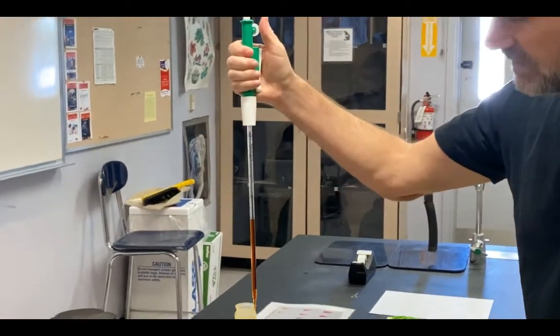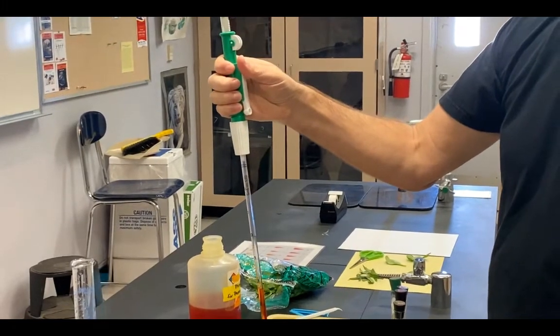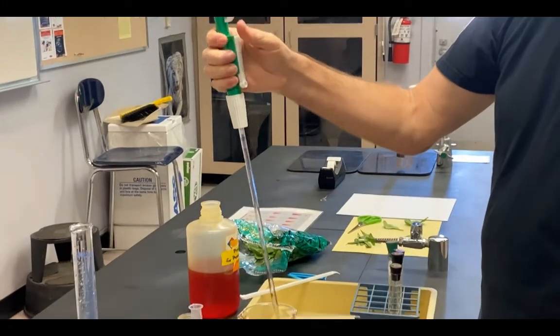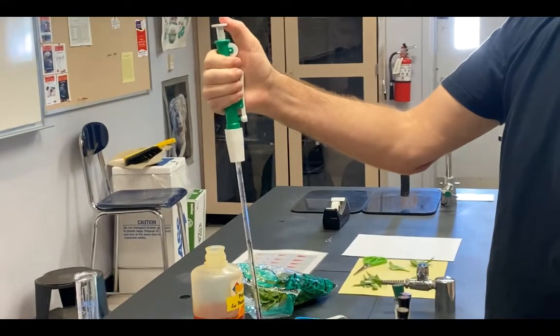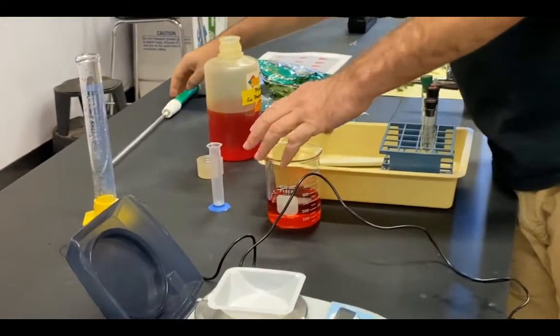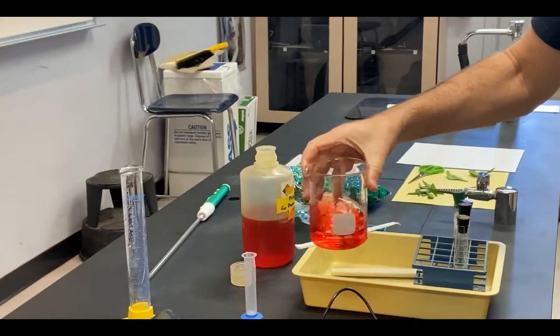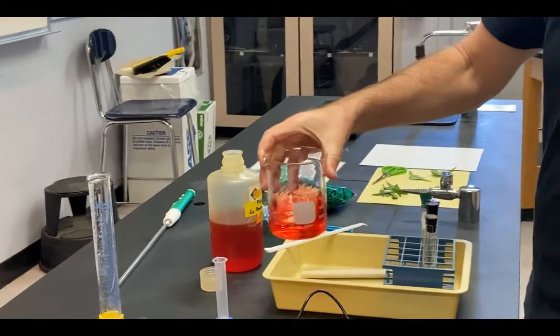So I'm going to fill that up. I'm going to add that to my beaker here. I can just click this button to release. And if I want to, I can push down on top or use the wheel to make sure I eject all of that. So at this point, I have my phenol red, and I can mix that up just a little bit. And I think back to my tubes.